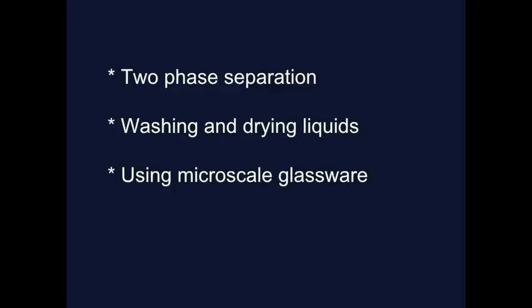This video talks about two-phase separation, washing and drying liquids, and how to do that with microscale glassware.